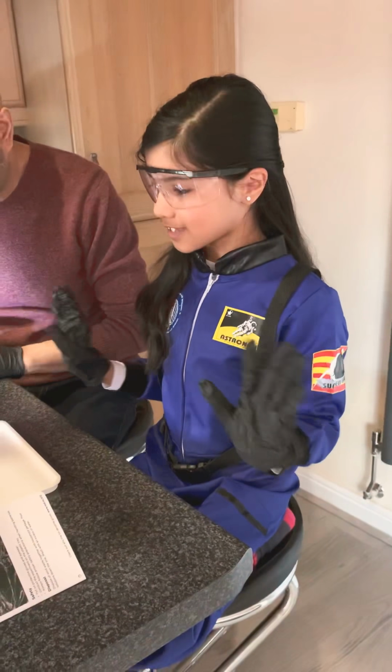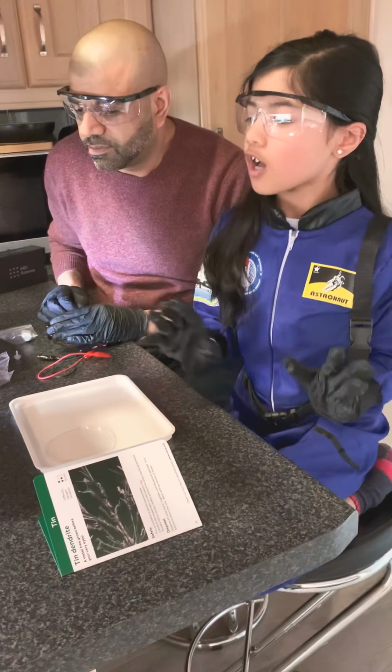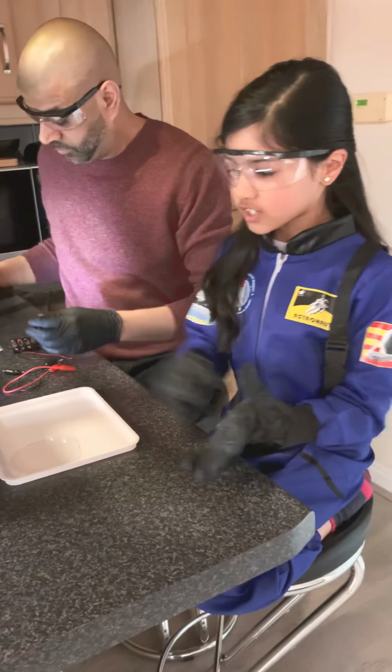So let's get started. Make sure if you're doing this, you need to prepare four AAA batteries for this experiment.